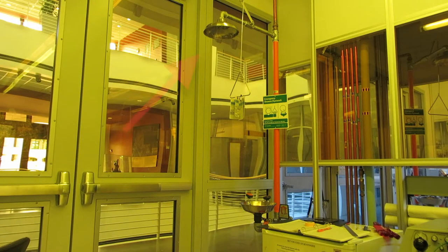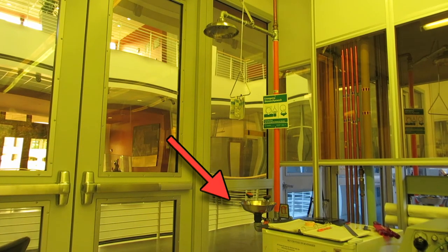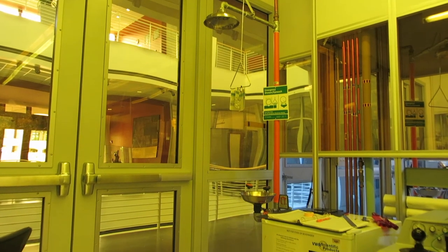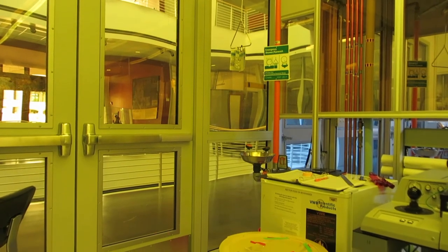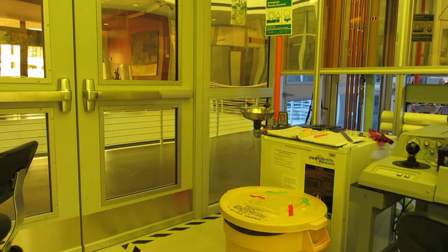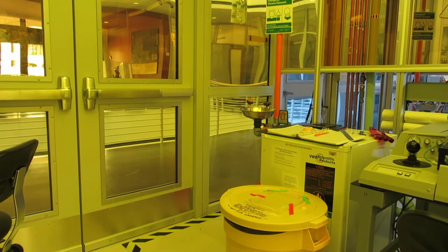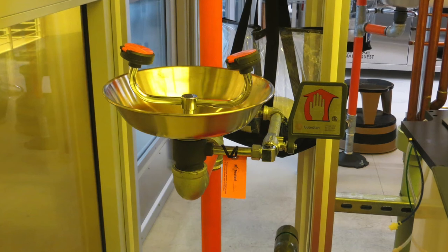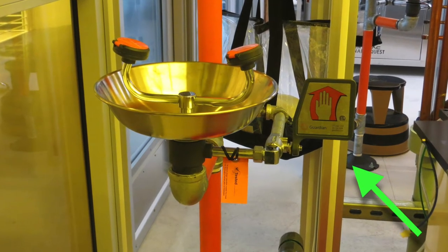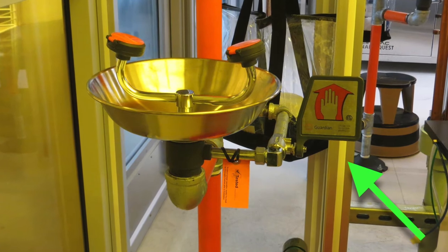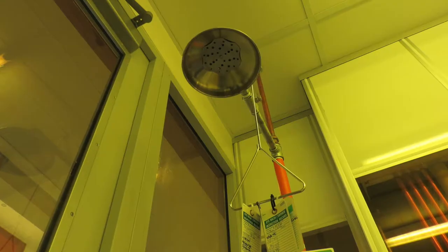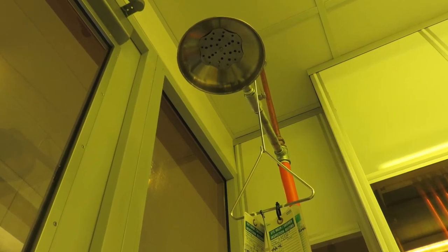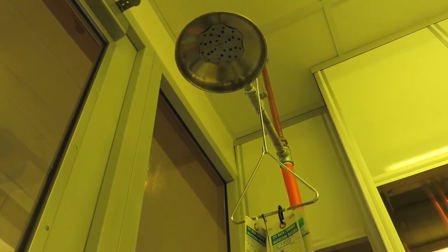In the right rear corner is the safety shower and eyewash station. Make sure that the path to this is always clear. Also make sure that the checkered outline on the floor is clear. Also over here is an explosion proof refrigerator used for storing things such as temperature sensitive resists and adhesives. To use the eyewash fountain, lean on the paddle to the right. Use your fingers to hold your eyelids open and flush your eyes out thoroughly. To use the safety shower, pull on the ring. Both of these dump on the floor so only use these in an actual emergency. The floor is not drained.